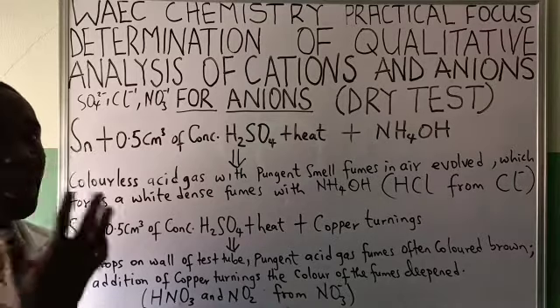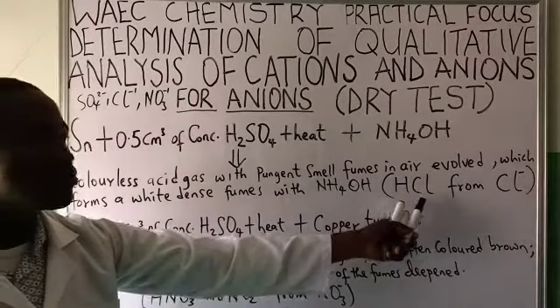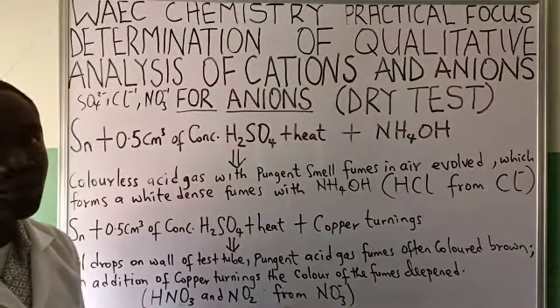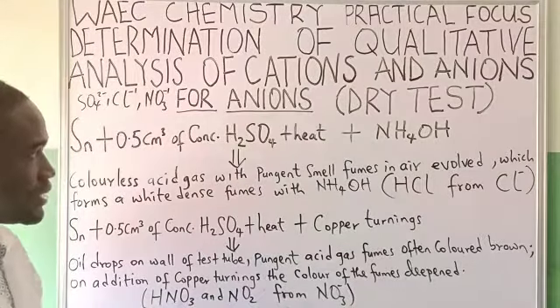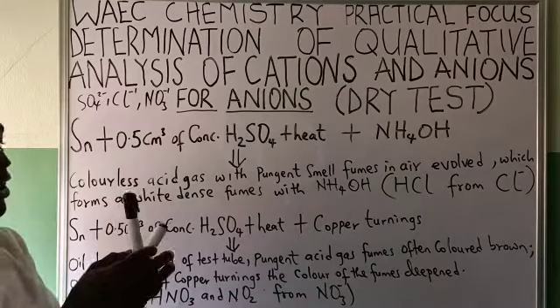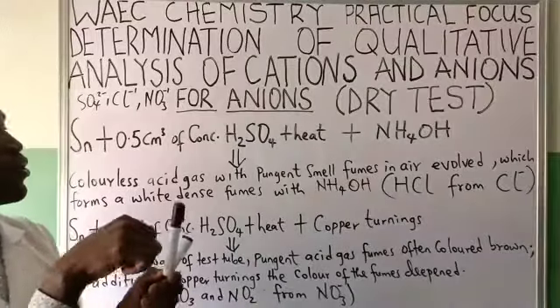Even wear your eye goggles to protect your eyes, because the gases that will be evolved have a tendency to blind anybody who handles them carelessly. Okay, so I have collected a small quantity of the salt sample. I've added a few drops of conc H2SO4.